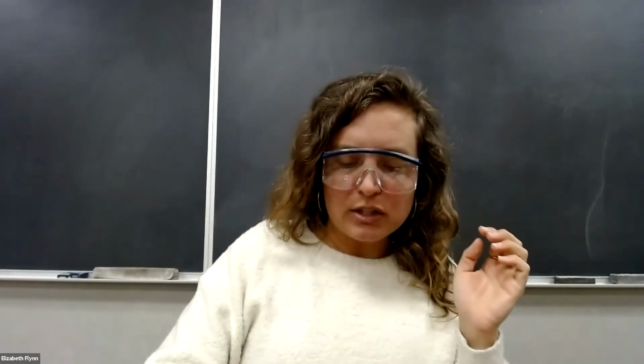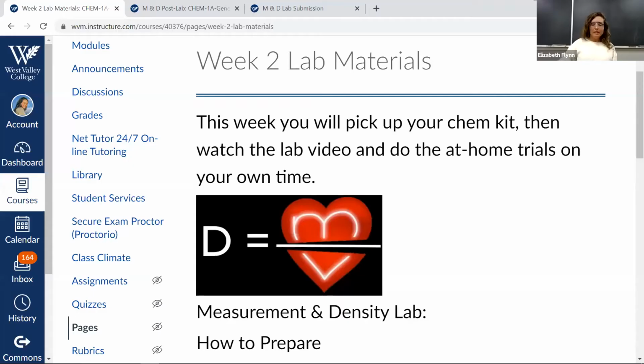So I'm going to share my screen, and here's where we are. Measurement and densities. So we're going to take what we learned previously about measurements and how important significant figures are, and we're going to apply it to a lab in order to calculate density of different substances and to just make sure that we're recording measurements properly.